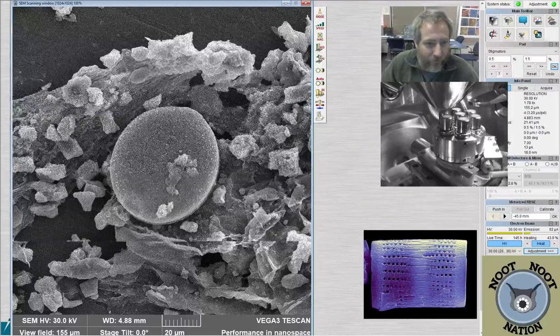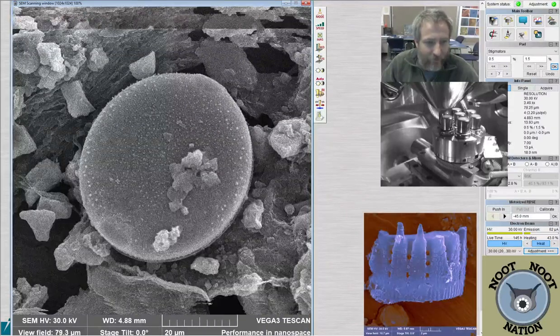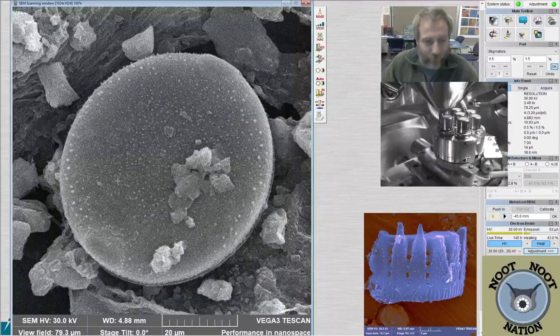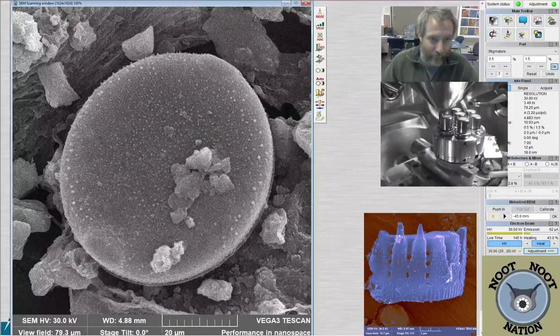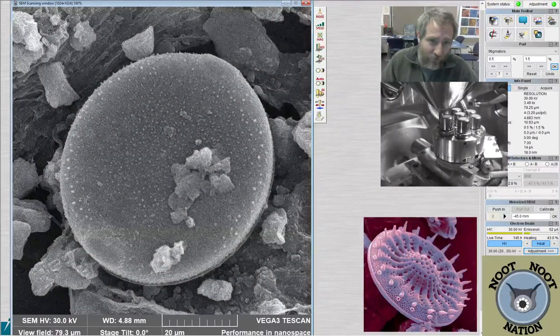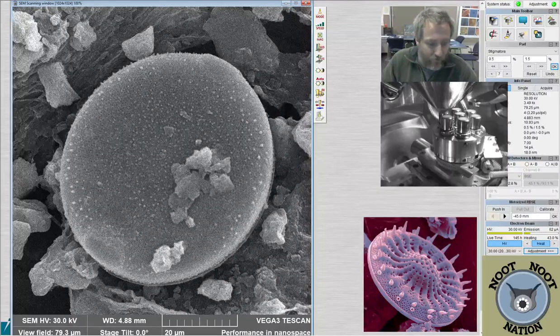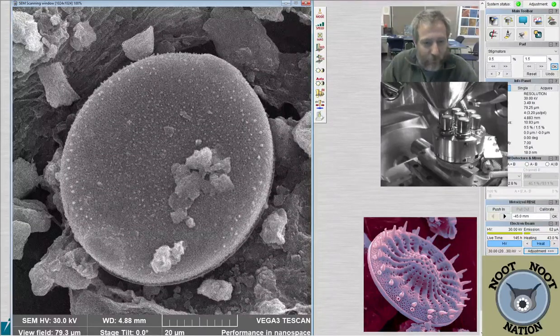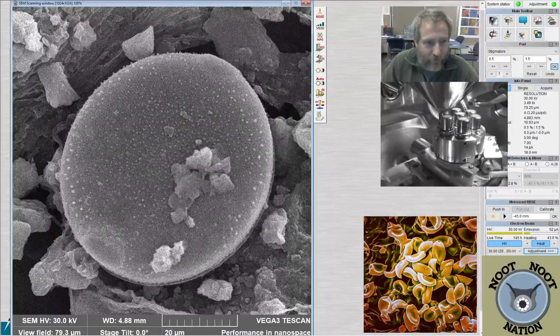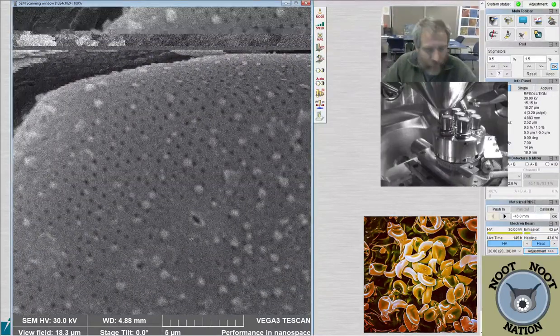And we've seen internal views of it occasionally on the SEM, but rarely any sort of clear view of it in the external view. And these little structures that you see sort of raised up on slight elevations are little tiny pore fields. So it'll be kind of interesting to zoom in on this guy and get a good look at it. I'm first going to try to get it in focus for us, which is critical.